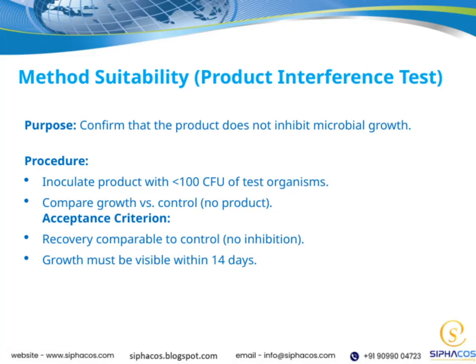Now, let's talk about the purpose of this step. Essentially, we want to confirm that our product does not inhibit microbial growth. This is crucial because if the product were to prevent microbes from growing, it could interfere with our testing results and lead to inaccurate conclusions.